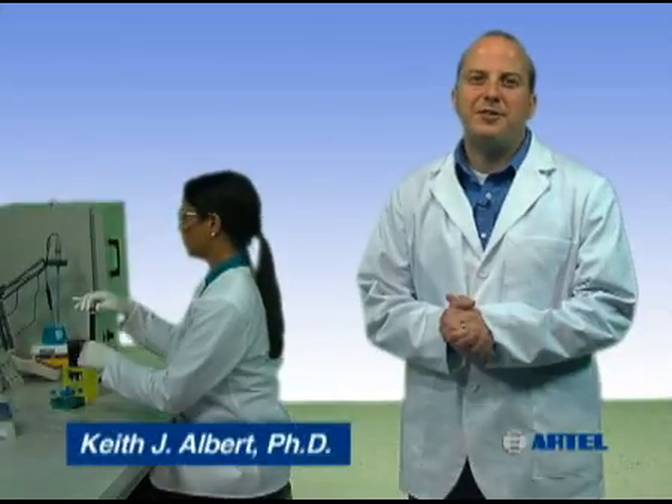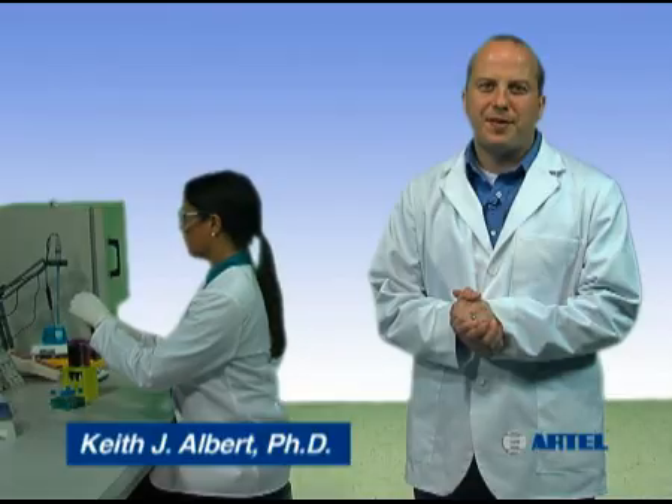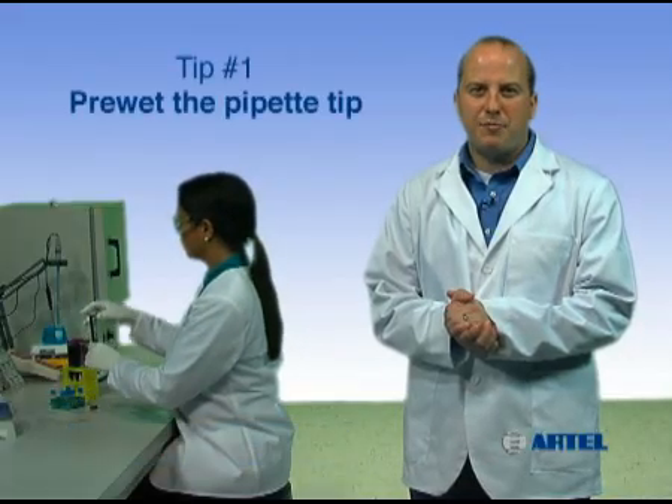Build confidence in your assay results by using proper pipetting technique. Pipetting tip number one: pre-wet the pipet tip.